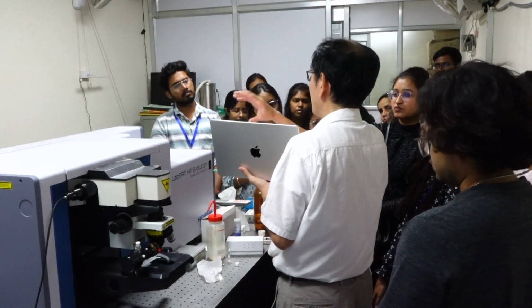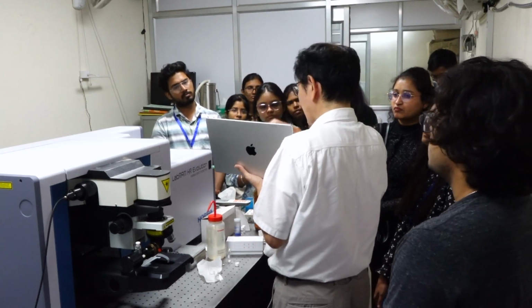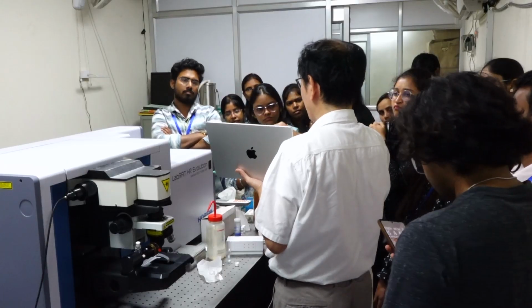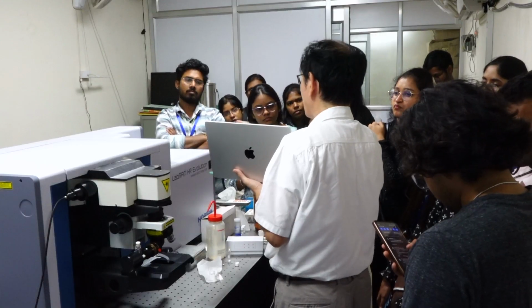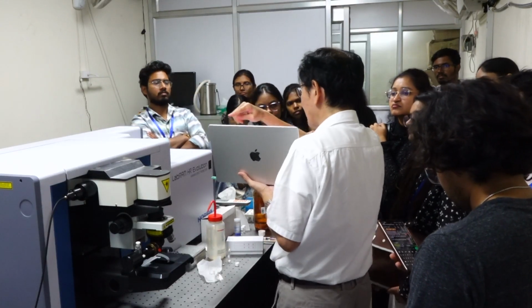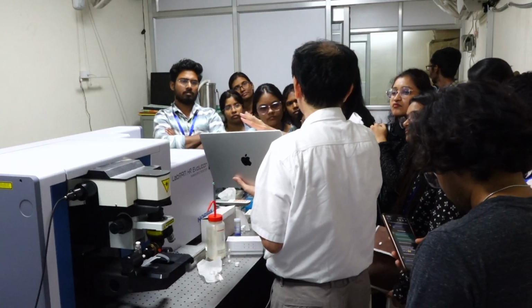At that time, error occurs. So if the measurement count is small, that kind of analog to digital conversion noise becomes prominent. To avoid such a situation, we should accumulate signal count; the maximum is 2 to the 16th power, around 65,000. If we reach a signal intensity close to 65,000, then the AD conversion noise becomes less prominent.